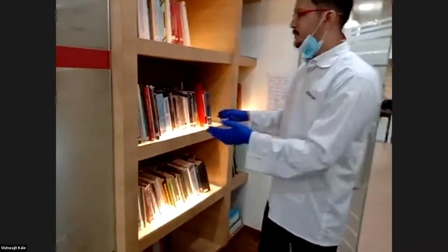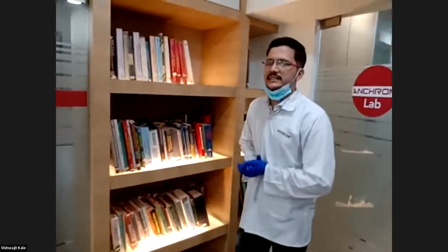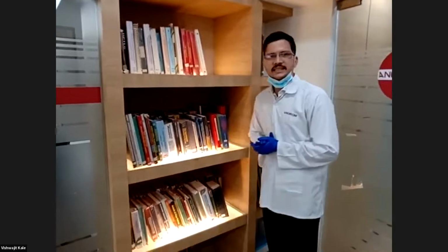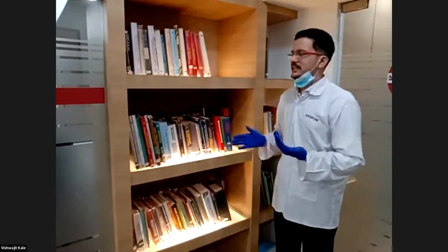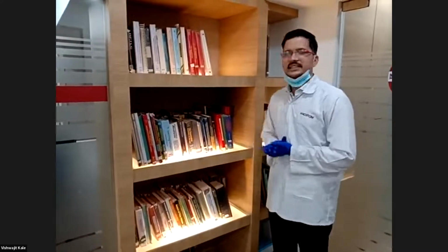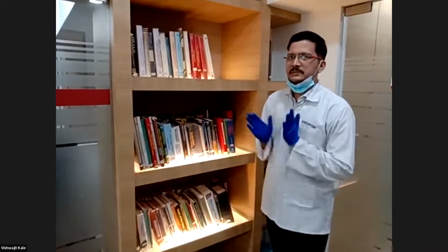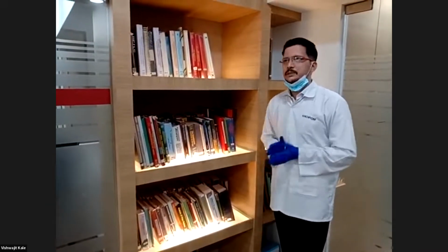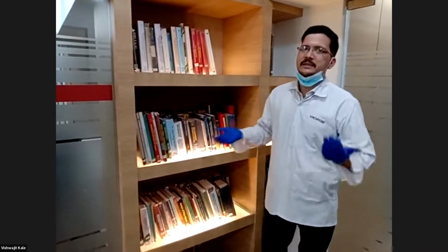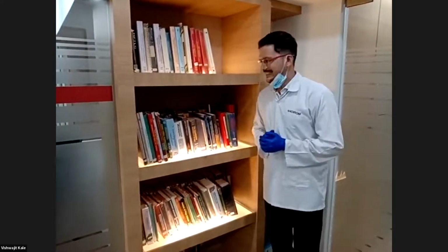All reference books you can see are required for a detailed literature survey in HPTLC method development. Because of this library and all the literature available with us, specially dedicated to this single technique, for the last 40 years we have been able to develop new methods and separate challenging compounds from complex sample matrices. Can you show a few books?